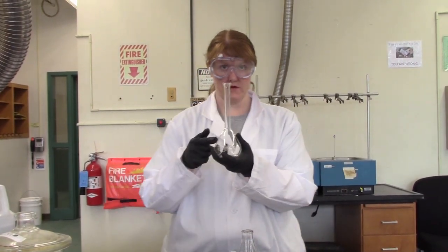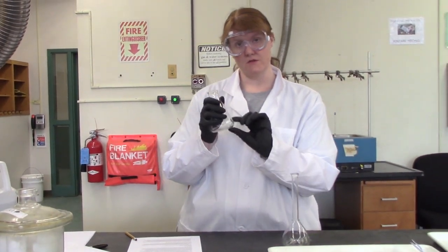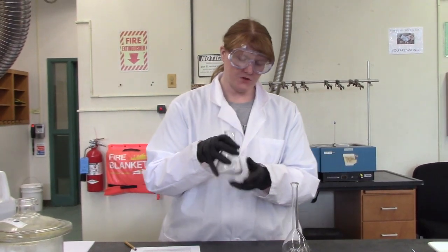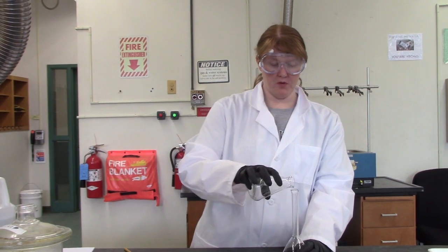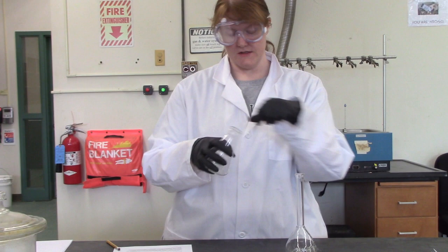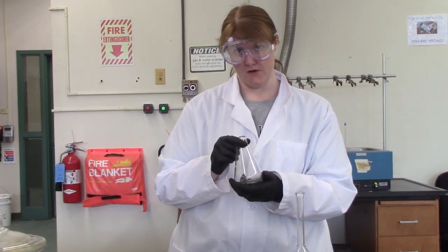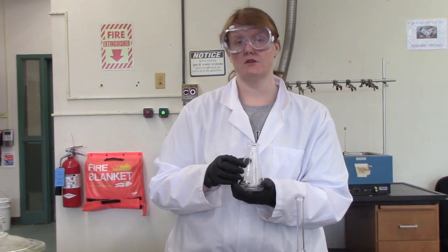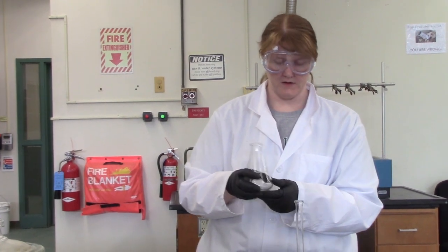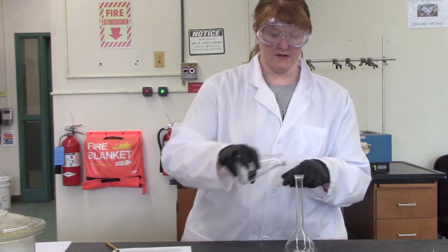Your volumetric flask is one of them, okay? So what you're going to do is have your oxalic acid dissolved in just a small volume of water. I would say less than 100 milliliters if you can do it. You just swirl until it dissolves, and then you pour it into here. Then take your deionized water and rinse this flask into here at least two or three times. Again, remember from our transfer loss experiment that at least two or three rinses is required to remove the material from a transfer, okay? So we want to make sure that all the oxalic acid we put in dissolves in here, and then we pour it in here.